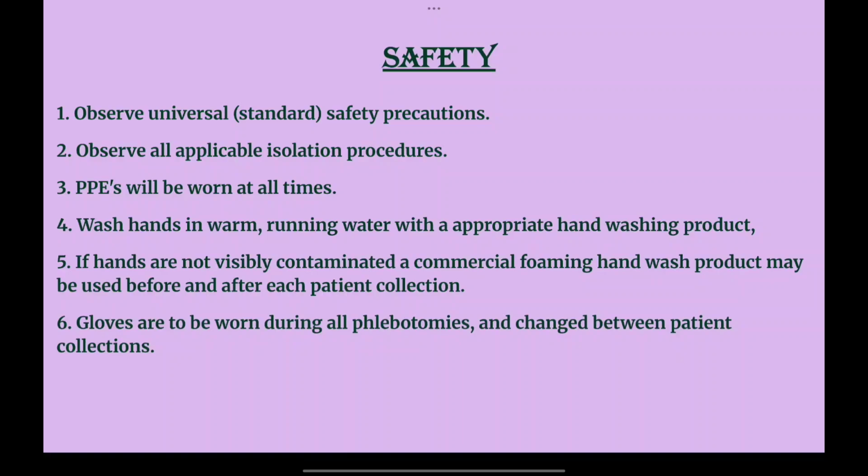We have heard this word PPE during COVID time, or the corona period, because it was essentially used by all the healthcare professionals to avoid and contain the infections. So PPE is personal protective equipment kit. Now we'll see the image of what PPE consists of.